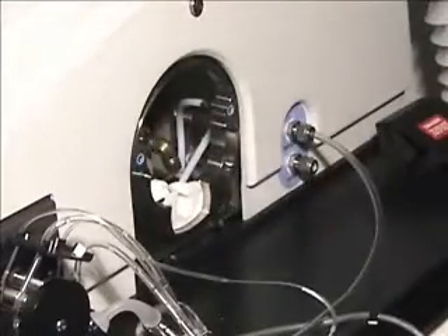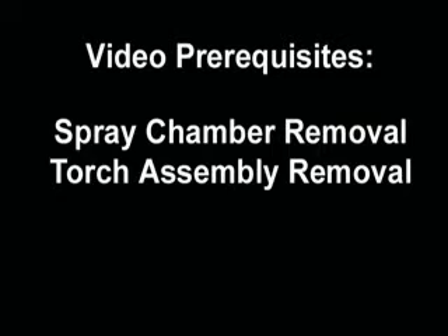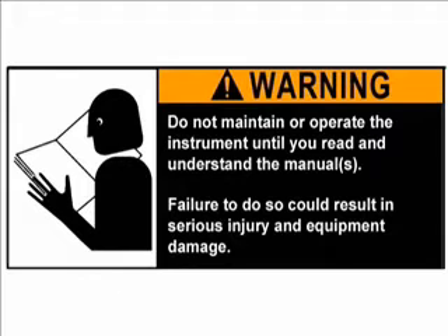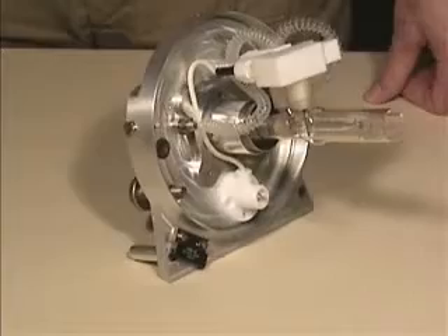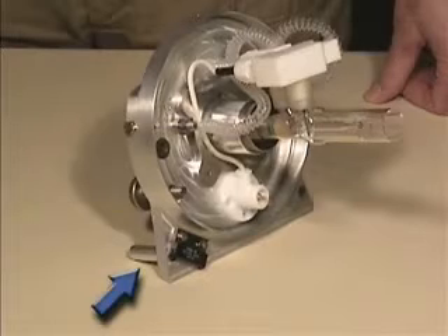The torch is now ready to be serviced on a bench. Wear the appropriate powder-free gloves and work with the torch on a clean surface. Angle it back 45 degrees so that it sits on the stands mounted on the torch housing.